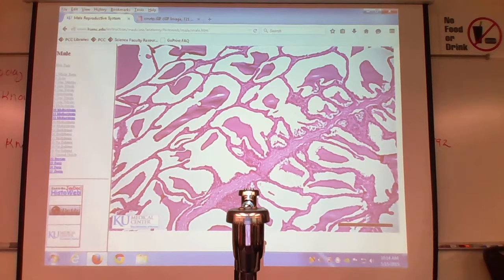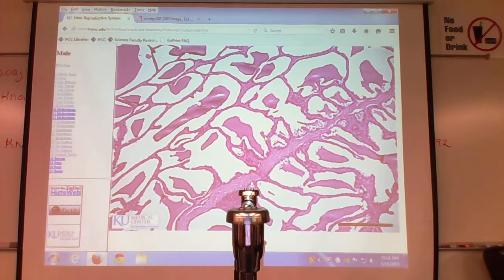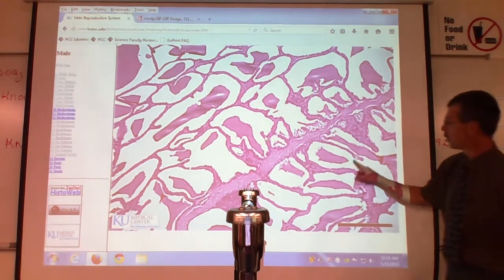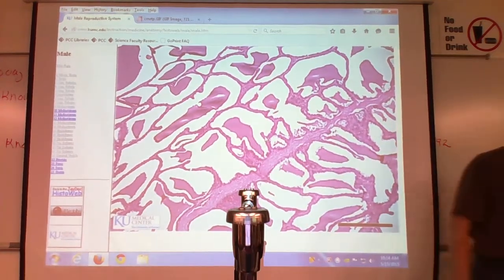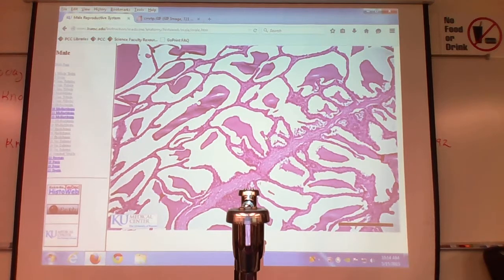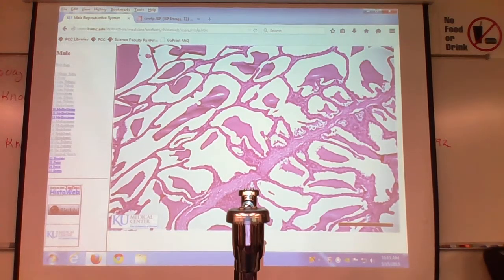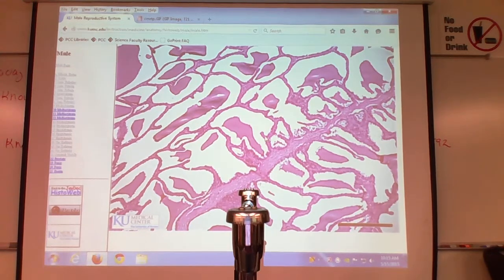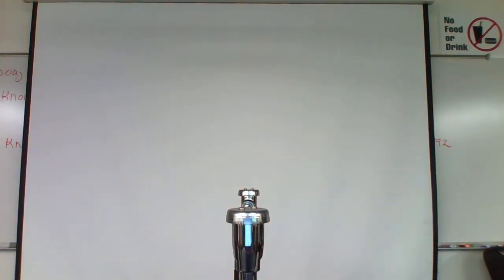So you're looking for a weird-looking sponge. Rorschach test. So weird spongy stuff. Wait, I'm sorry, I wrote the mucosal folds are the red. The red. Okay, and the smooth muscle, that red there. Right. Okay, so come around. We're going to go through a bunch of other stuff, and we're going to end up in the penis.